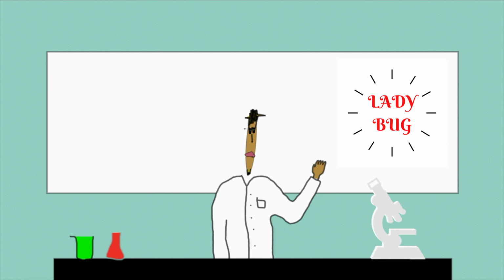Holy crap, what is that? Here you can see the remnants of a larval form of ladybug grub, which is the entire reason that they grow the armor plating, that they adorn with the blood of their enemies, and one spot for each enemy they vanquished. At least that would be a cool scenario, but not quite the truth.